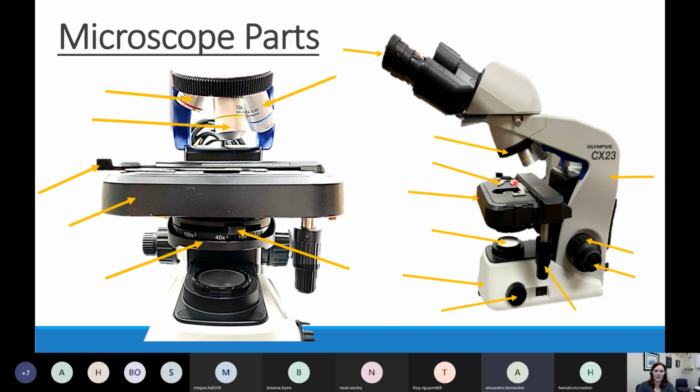Maybe when I loaded it onto my microscope, I'm focusing on the label, which doesn't have the tissue I'm looking for. I clip that slide into place in my stage clip, and then I can use these things hanging down over here, my stage adjustment knobs, to move that slide back and forth, left and right. So that stage clip is also what we see right here.